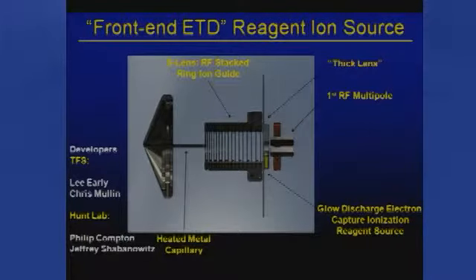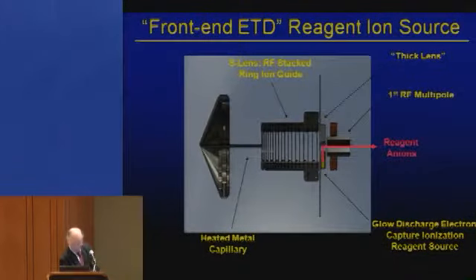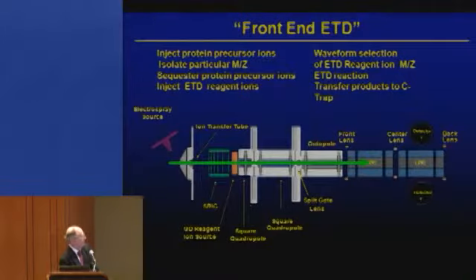So this is how it works. There's the little Shrig, and it's just part of basically a lens structure, but it has a gaseous discharge in it, and it'll be pulsed on and off to create negative ions whenever we want them. So electrospray ionization comes in from the front, or Sarah's technology, and this would work with her technology as well. And so the electrospray ionization sends the ions over to the linear trap, and whenever we want negative ions, we just turn on a pulse here, and it creates our negative ion reagents to go in and do the chemistry that we want to do.